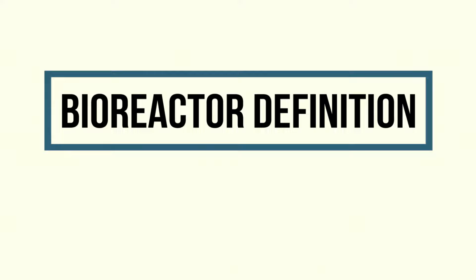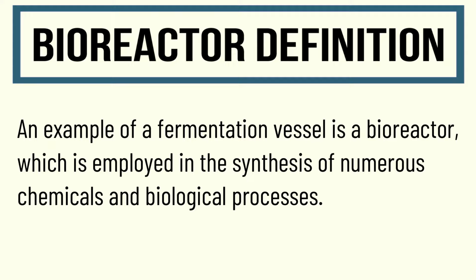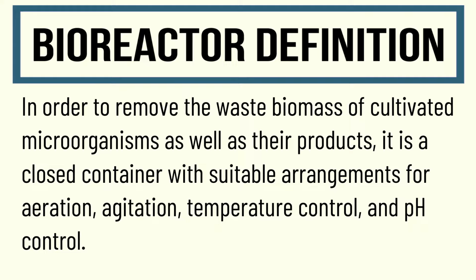An example of a fermentation vessel is a bioreactor, which is employed in the synthesis of numerous chemicals and biological processes. It is a closed container with suitable arrangements for aeration, agitation, temperature control, and pH control, in order to remove the waste biomass of cultivated microorganisms as well as their products.